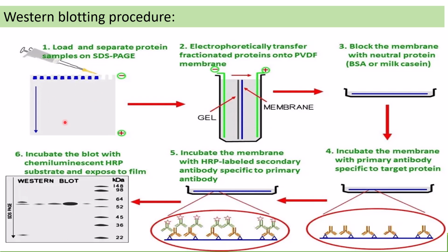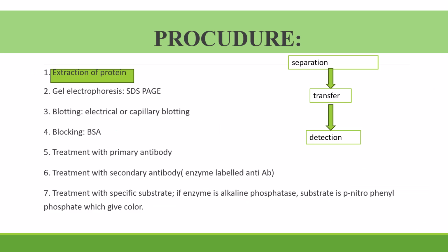So this step comes during visualization, when we add the substrate. When we add the substrate, the images will give certain fluorescence, and that fluorescence is detected. What we discussed in the previous slide, the step-by-step things, are written there. I'll provide you the PPT, or you can note it down and learn it, just practice.